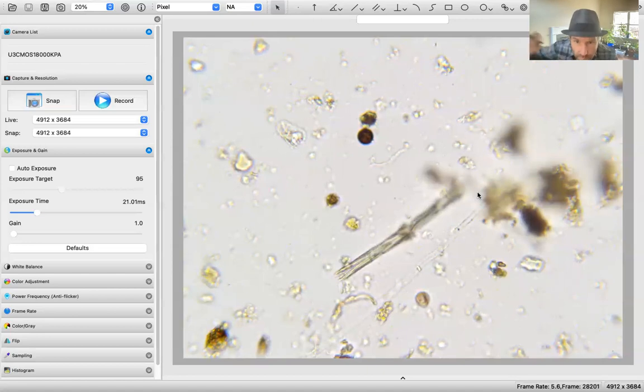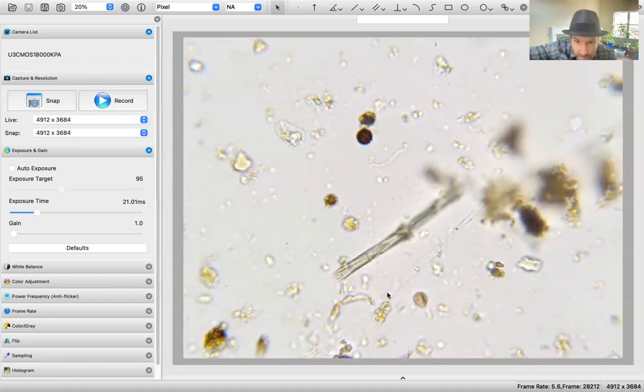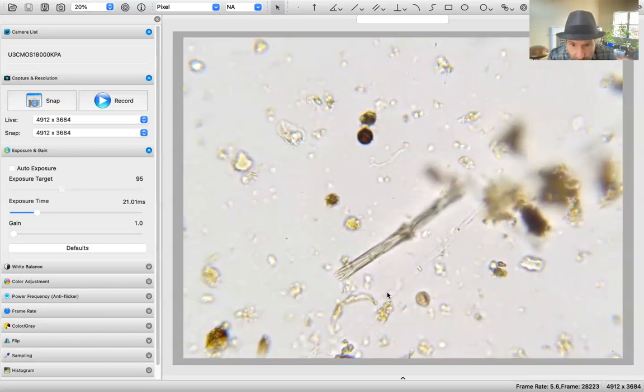Oh, right here is a bacteria inside. And I'm going to say 1, 2, 3. It's looking like a 5. 1, 2, maybe a 4. I'm going to say 4, actually, now that I'm seeing those little ones down there.